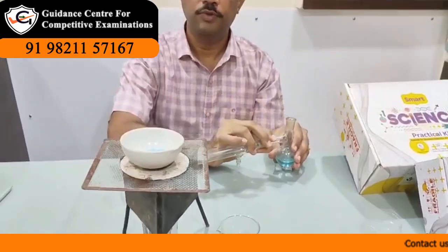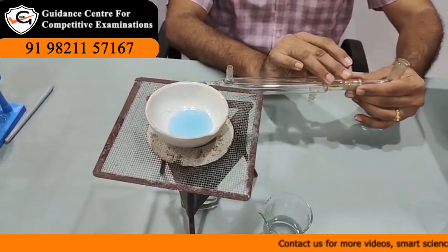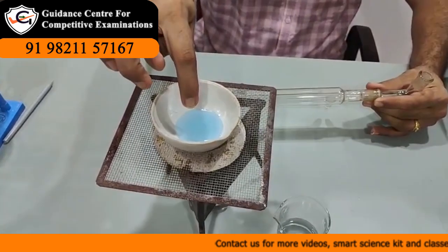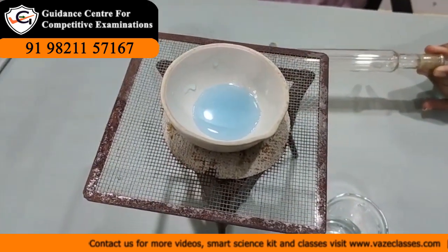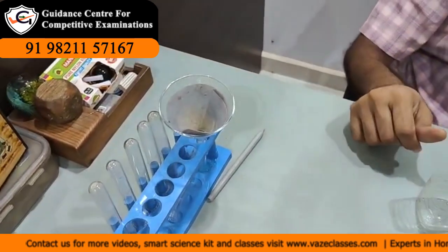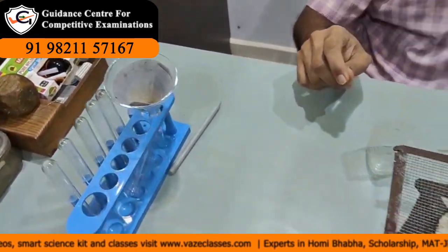But in filtration evaporation we get only the solute, that is copper sulfate crystals here, which is the soluble component, and the insoluble component is left behind as residue on filter paper, but we don't get the solvent back.